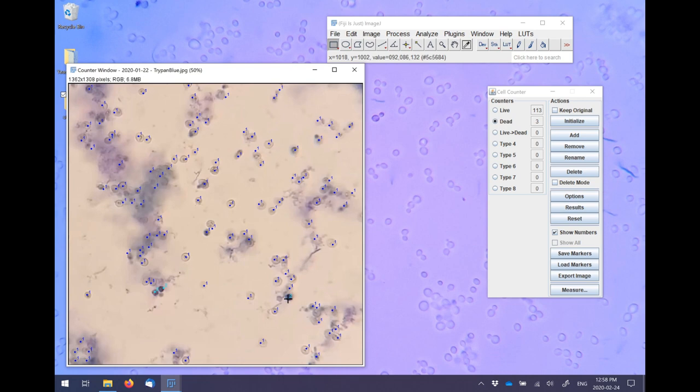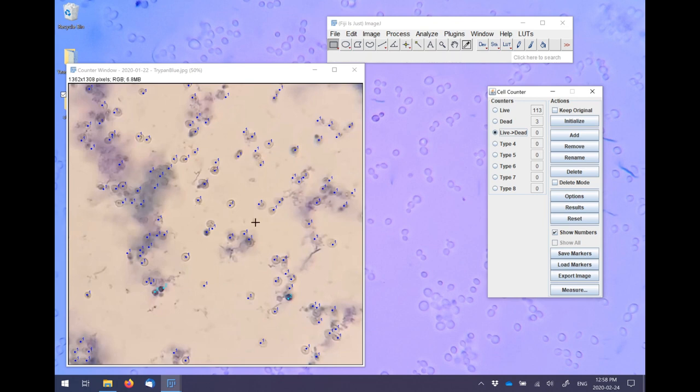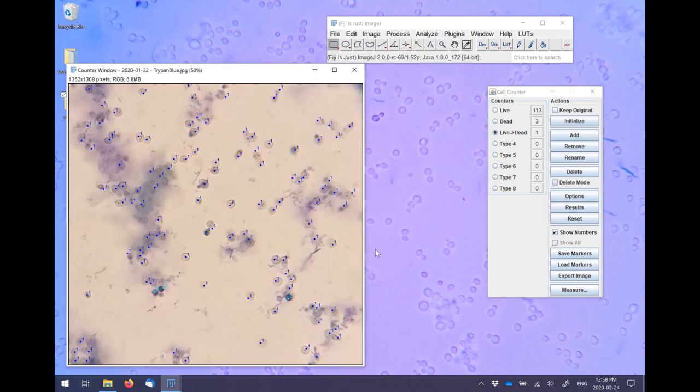Now if you make an error, you can simply create a third or fourth counter to reassign miscounted cells to the correct category. So for example here, I'm creating a counter of live to dead, or in other words, cells that I counted as live that in fact were dead.